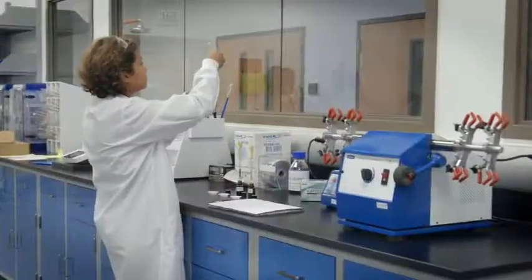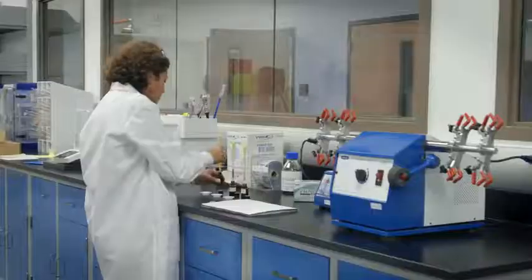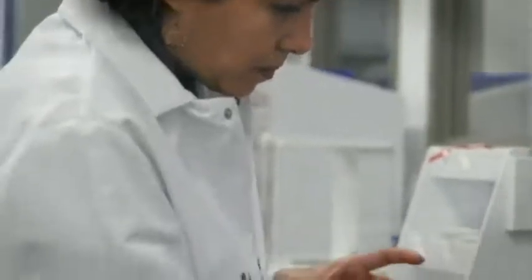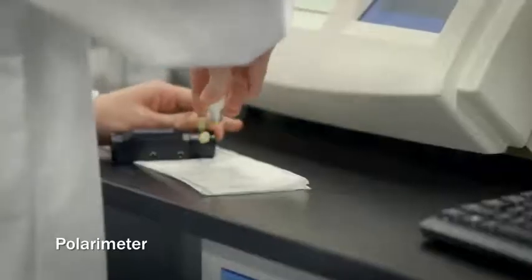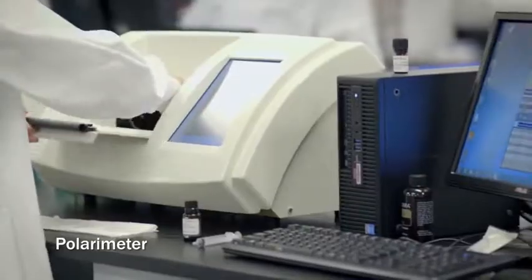After each oil has been identified by GCMS, further identified by FTIR, we actually test the physical parameters of each oil. And then the physical testing is a compilation of quite a few different tests. Optical rotation, in which we use a polarimeter, tests the chirality of the molecule. Sometimes chiral molecules can be missed on GCMS, so it's another verification.